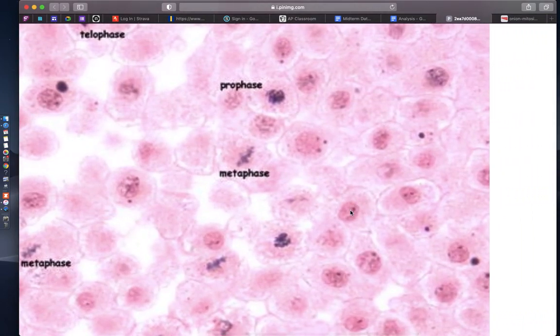And again, when we see cells that look like this, or this, or this, generally means that they are cells that are in G1 or G2. They're currently not dividing yet. Cells that are in G2 might have a bit more condensed chromosomes visible because they've been duplicated after S phase, but definitely these cells right here are all in sort of G1.